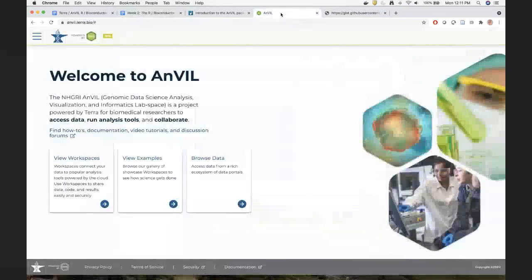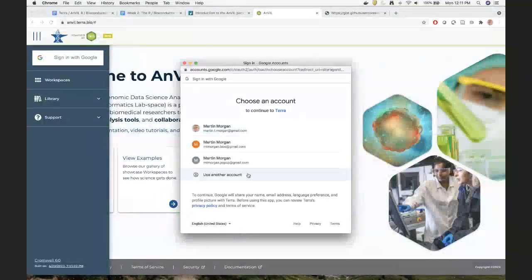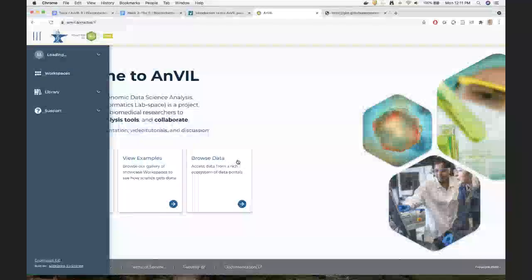We'll go to AnVIL, anvil.terra.bio, and then go to the hamburger and choose to sign in with Google and sign in with the email address that we used to register for the class.